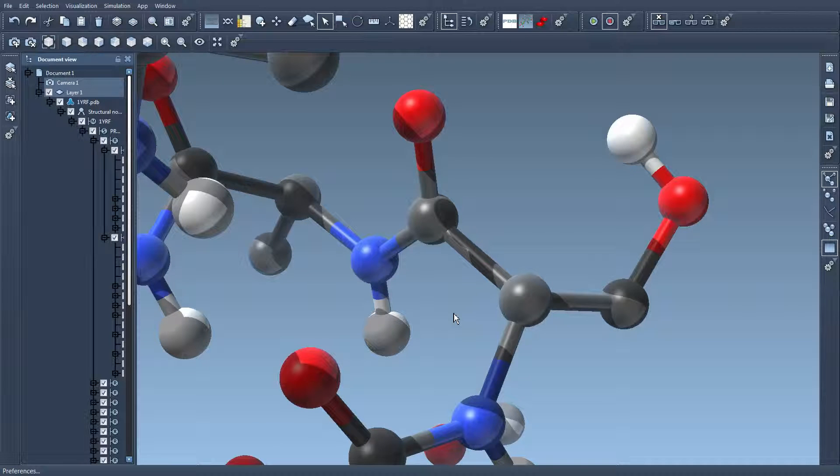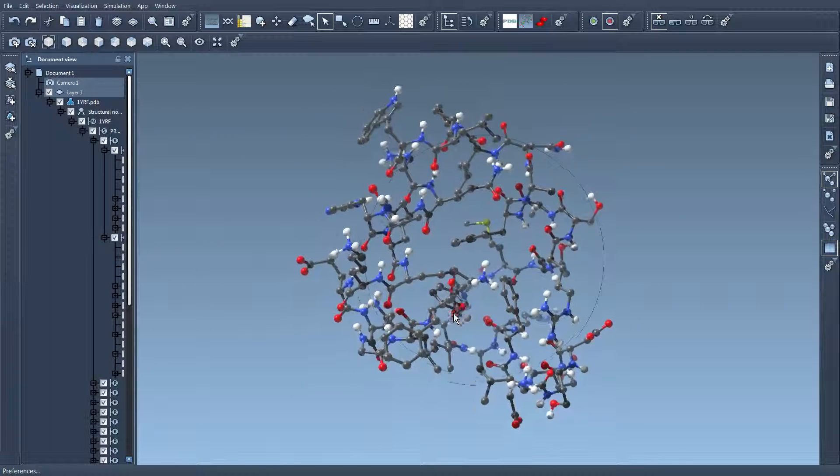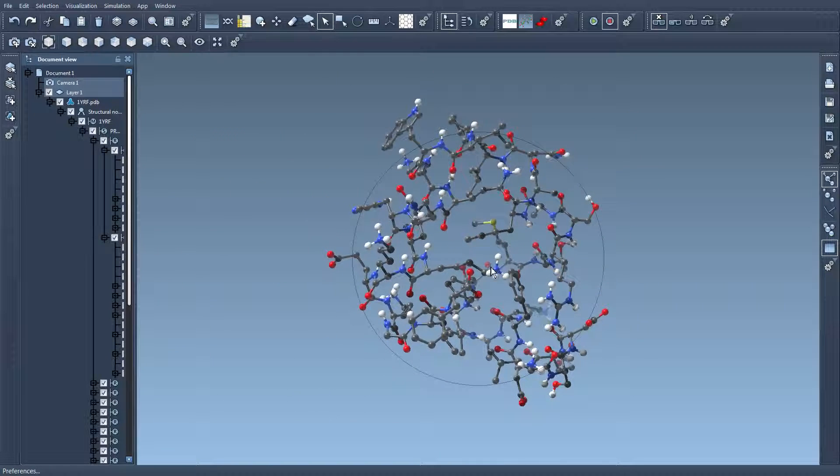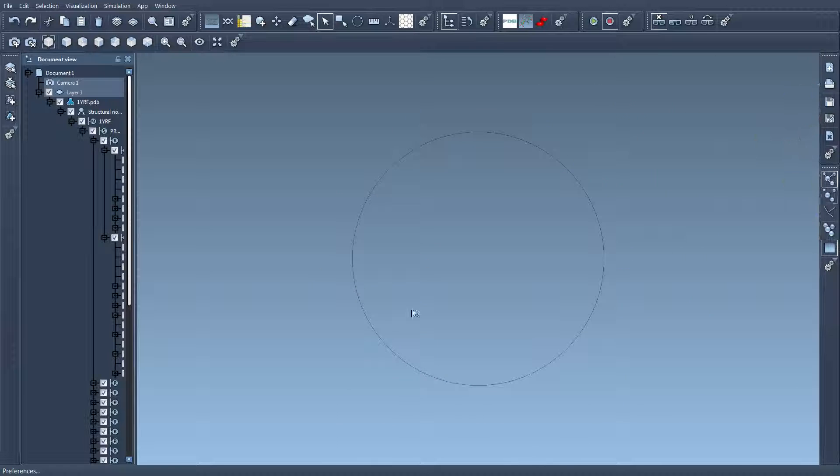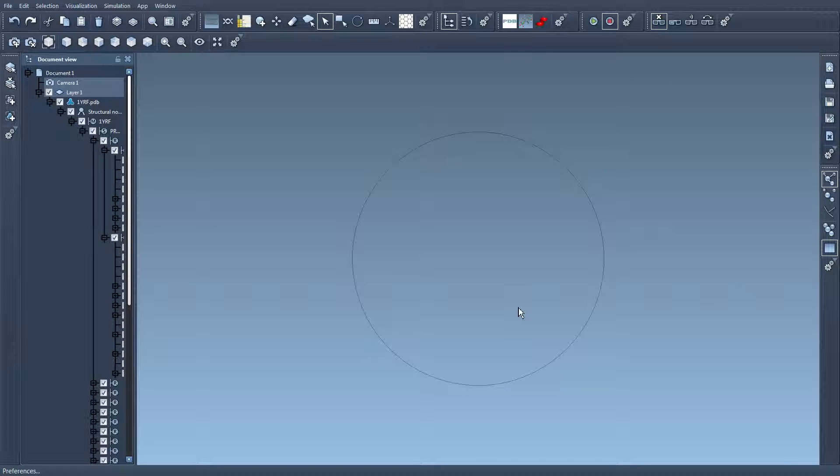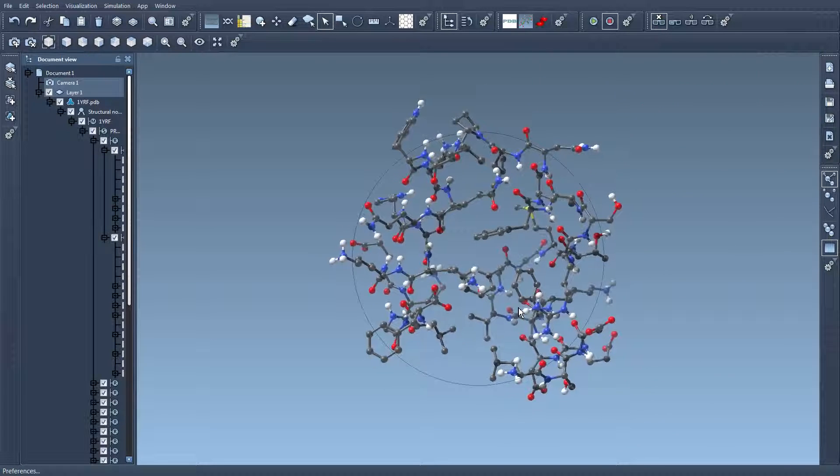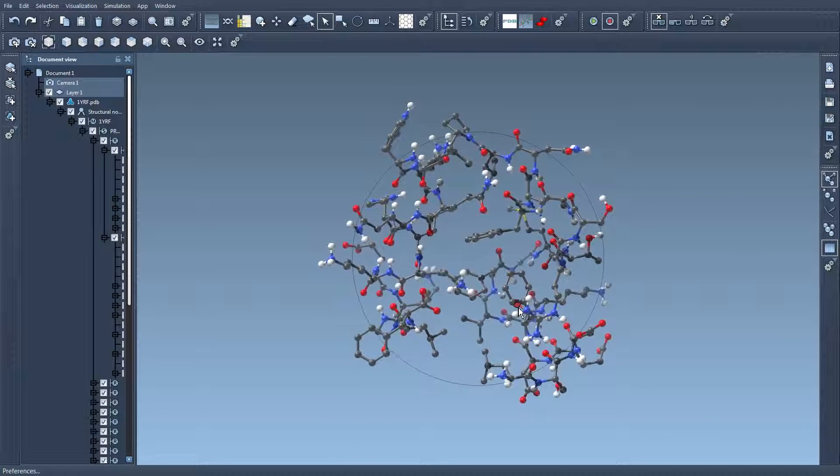Now if I want to have a full view of the molecular system I press shift space. So if you lose the molecule you press shift space and it comes back into view.